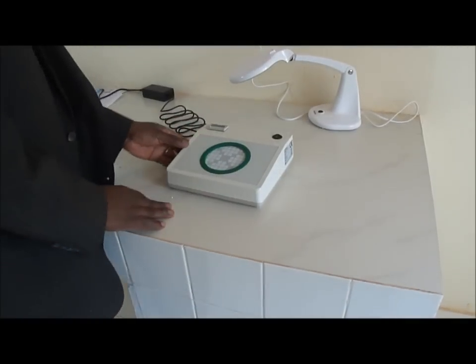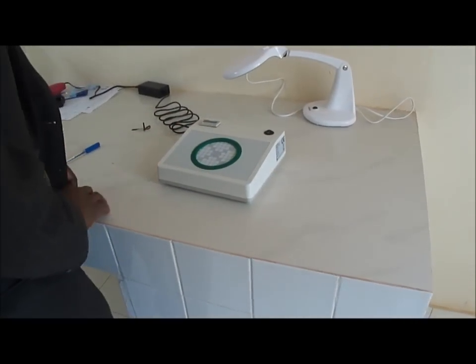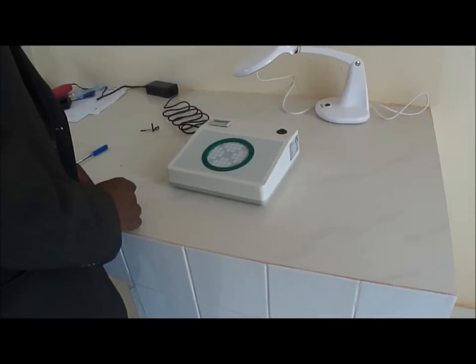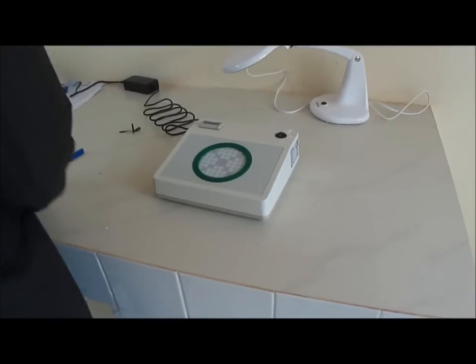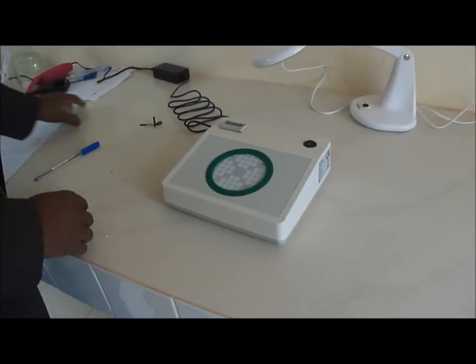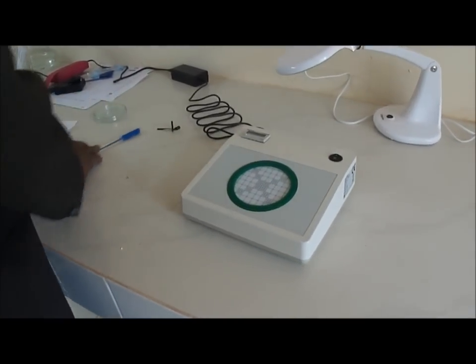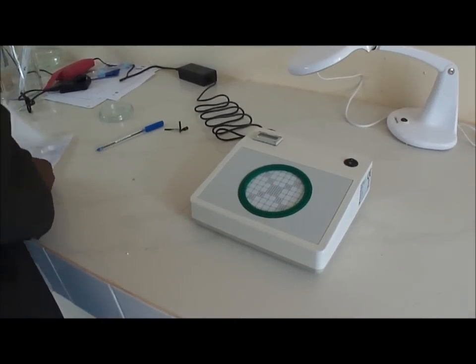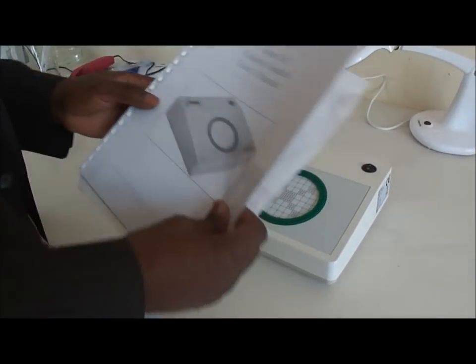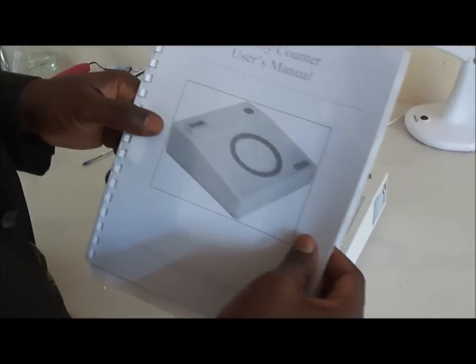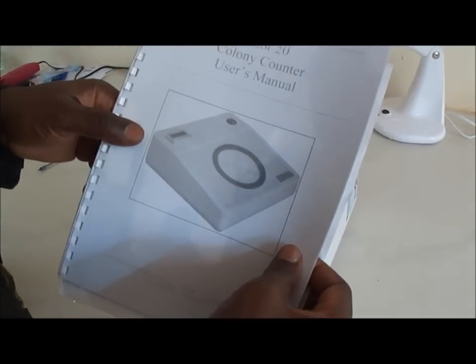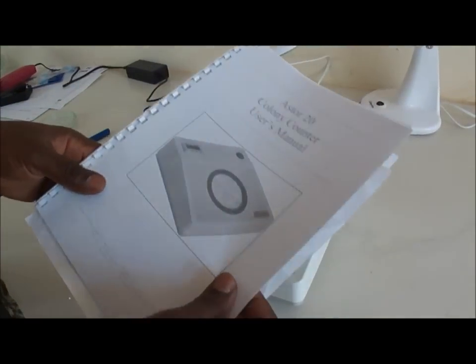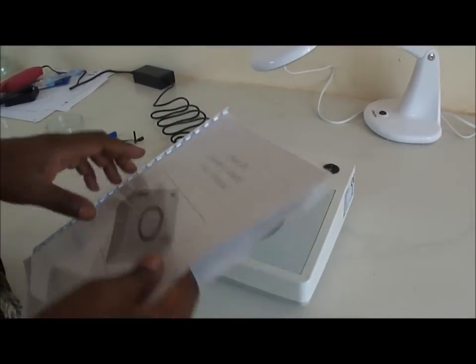In this video we want to explain how the device called the counter, the Colony counter, we have here the model Astor 20, Colony counter, how it works.